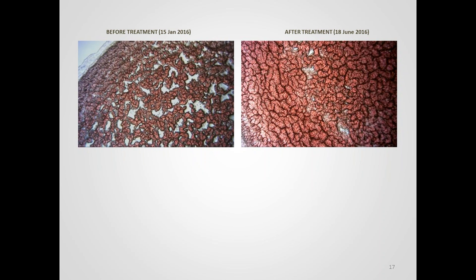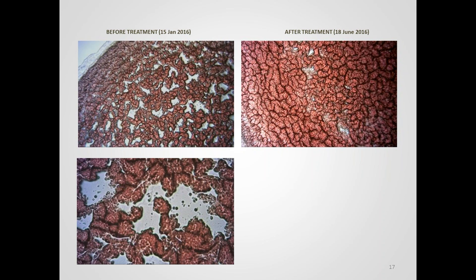Now you can see the change that has taken place here. There was actually a very high percentage of displacement of the blood in the initial visit, and after treatment about 6 months later, you can see that most of those areas have closed and knitted together, and we're not seeing nearly as many white areas.